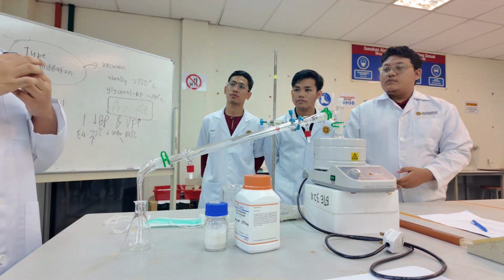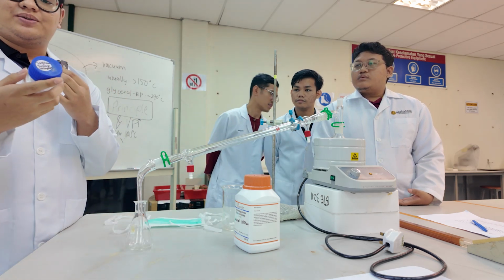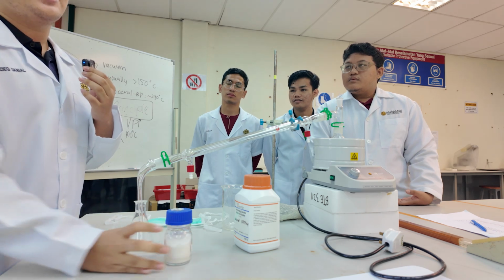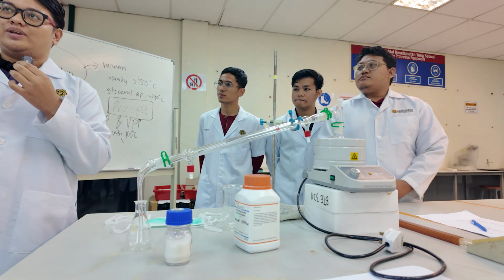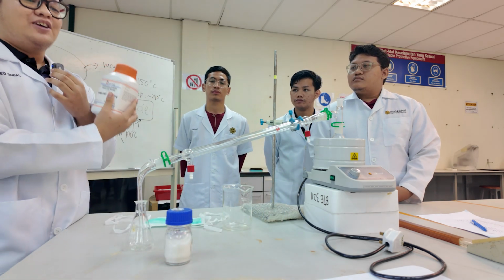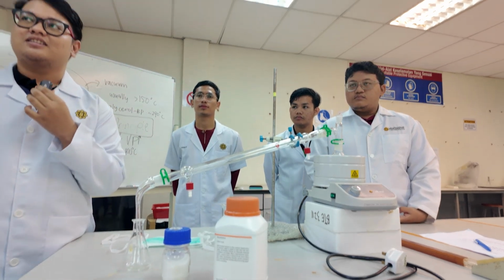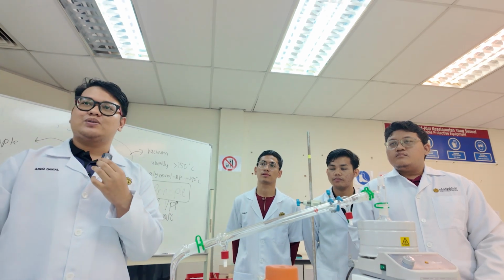In the simple distillation equipment, there is a drying agent, which is anhydrous sodium sulfate, which acts to absorb water in the solution, so we can get the pure solution. And also in our laboratory, we have anti-bumping granules. What is the function of anti-bumping granules?